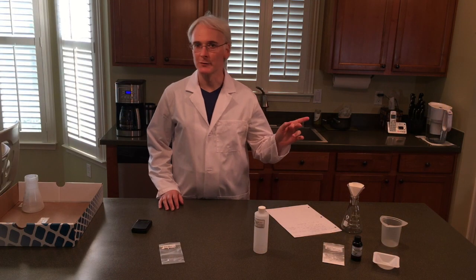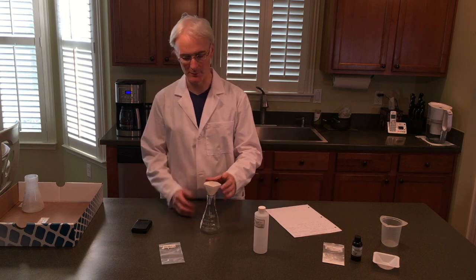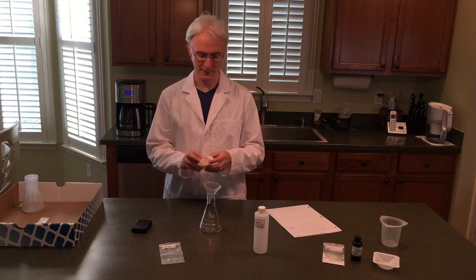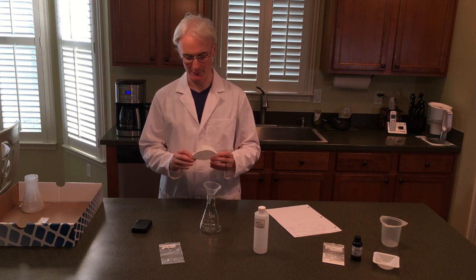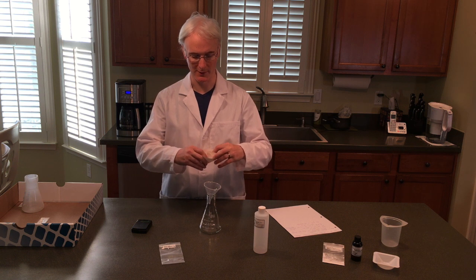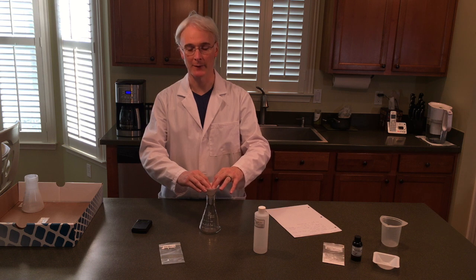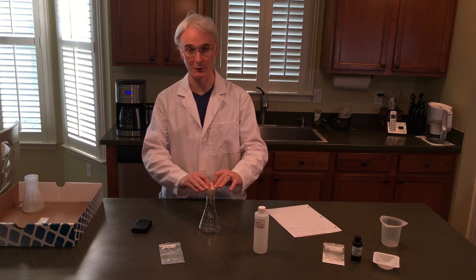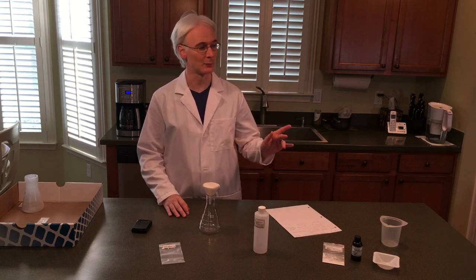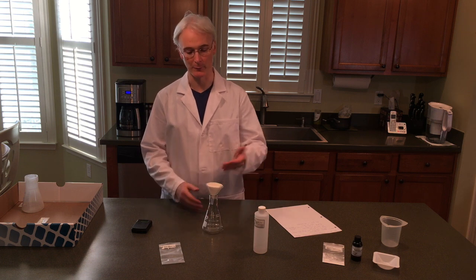So while we're waiting for that to do its thing, just take your Erlenmeyer flask, funnel, and a piece of filter paper. I've just folded the filter paper in half, folded it in half again, and then rounded it out. We're going to filter this solution after it has cooled — make sure that it's cooled before you start to filter it. We'll wait 40 to 45 minutes, take it off, let it cool down, and then filter it through.